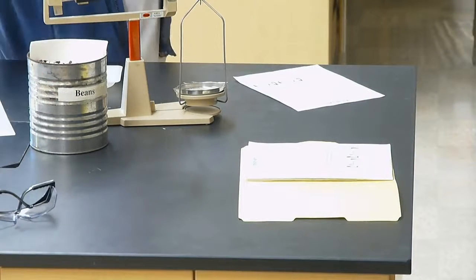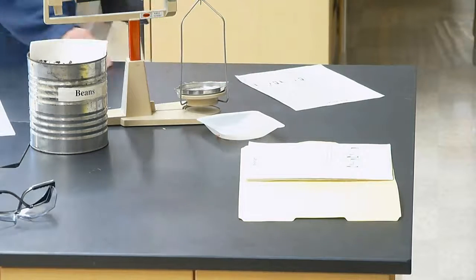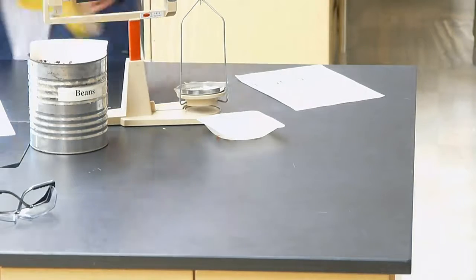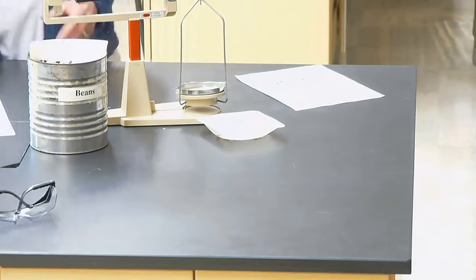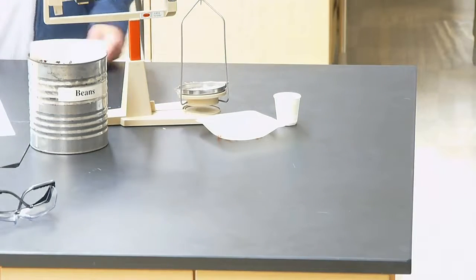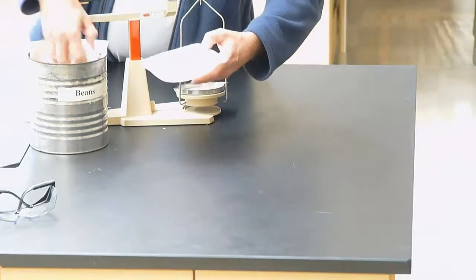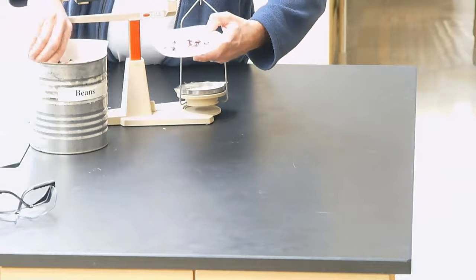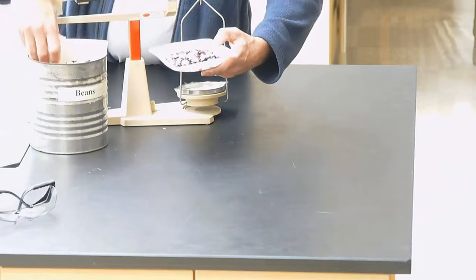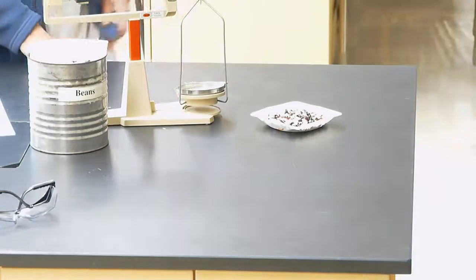They'll just be set on the table. You need a large weighbowl or 2 or 3 of them to do this most effectively. And then you'll take one of these little baby like fluoride cups, and then what you would do with that is you would take at least 3 full scoops of beans and put it in your weighbowl. All right, so as you scoop 3, that fills it up just about all the way full.